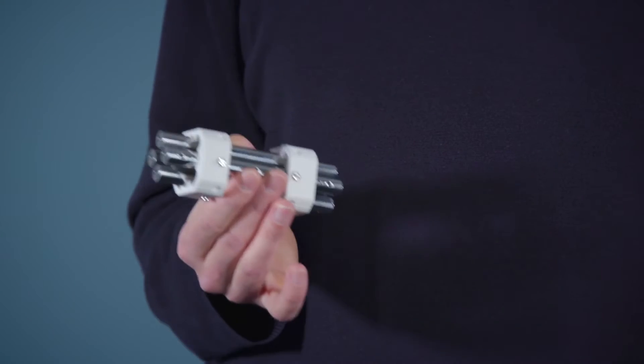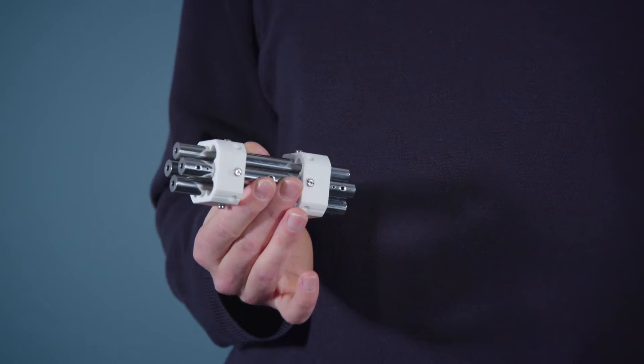So, a quadrupole is a mass analyzer. It consists of four parallel rods arranged around the central axis, as shown.